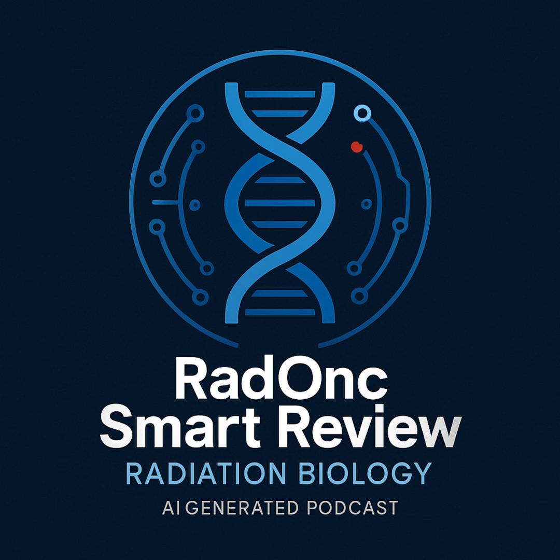The flip side is true too. For your control dish, 0 gray, always need a control. For that control, or very low-dose dishes, you need to plate fewer cells. Because if you plate too many and they all survive and grow, the colonies will merge into one big blob. You won't be able to count individual ones. You want distinct islands, not a continent. Nicely separated colonies are key for accurate counting. So we've seeded the right number of cells in all our dishes, different numbers for different planned doses, plus the 0 gray control. Now comes the zap.